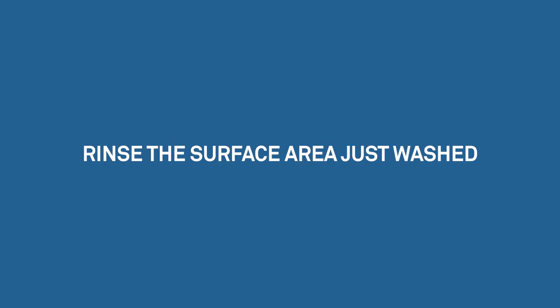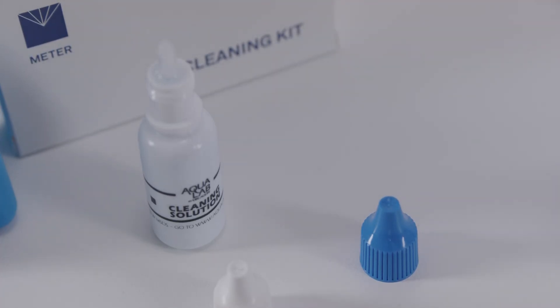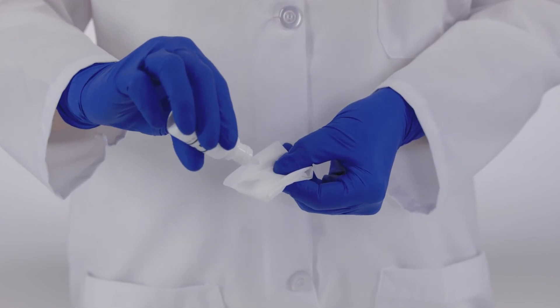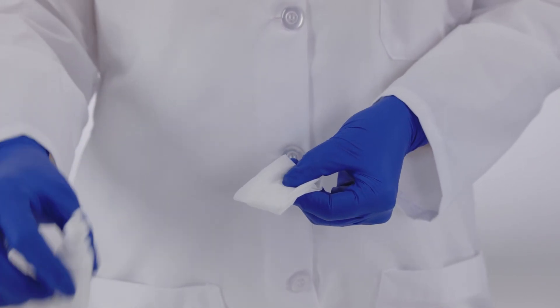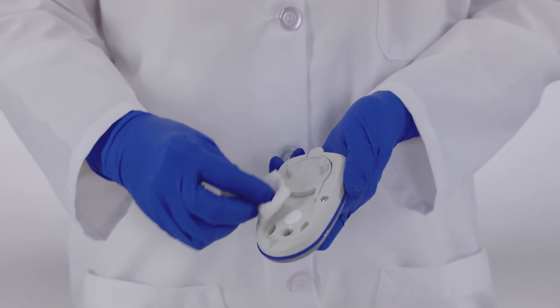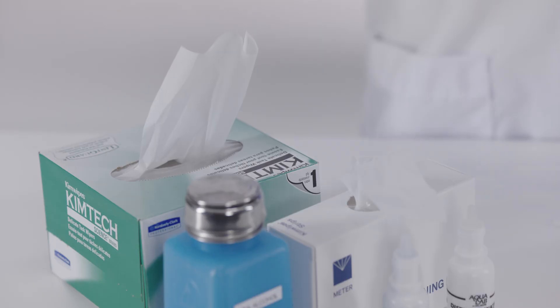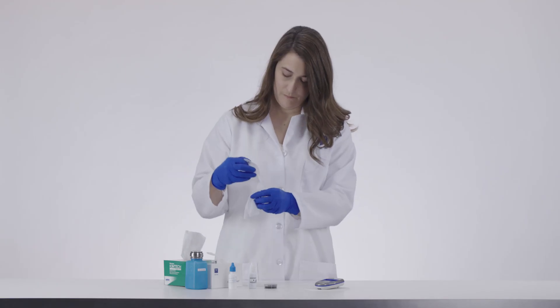Now rinse the surface area just washed. Get a new large chem wipe and moisten it with clean distilled water and rinse thoroughly. Be careful not to dip a used chem wipe into the cleaning solution, alcohol, or distilled water to avoid cross-contamination. Dry the area with a new dry chem wipe.